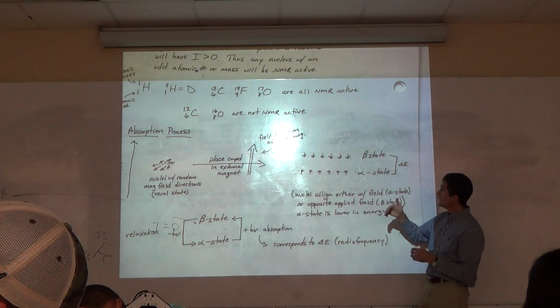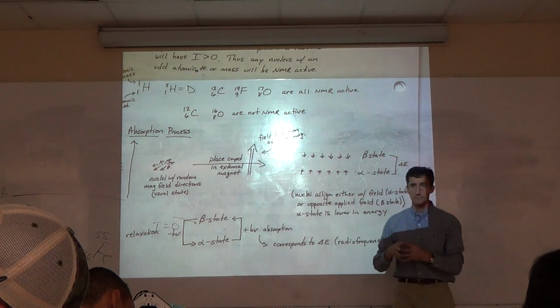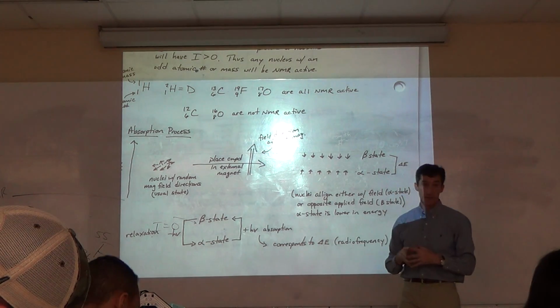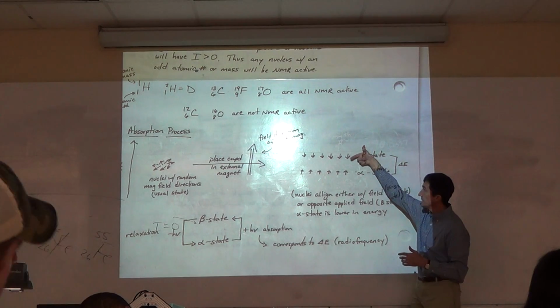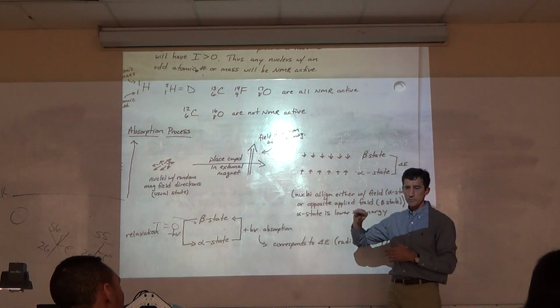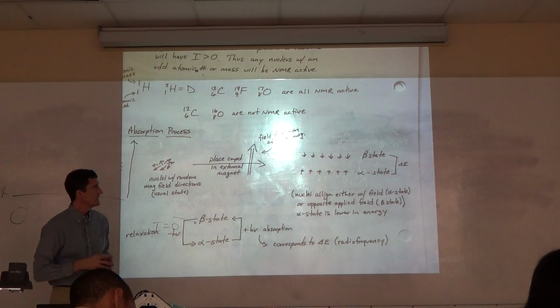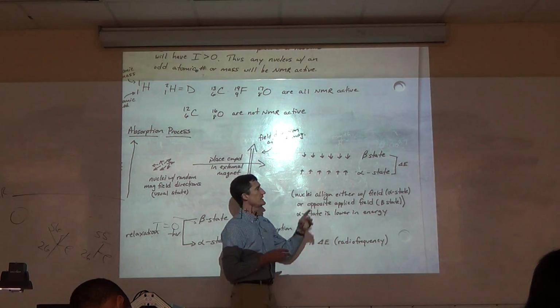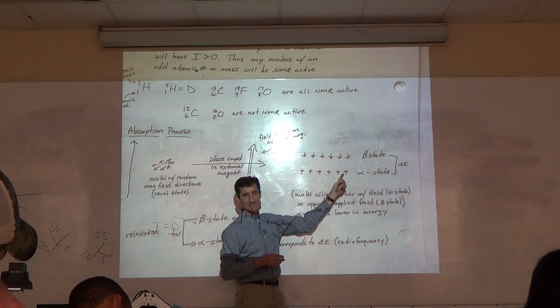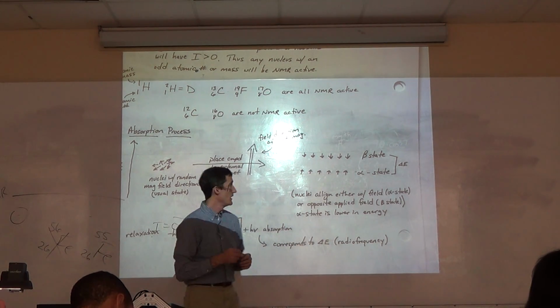But you'll also have some of those nuclei line up against the external field. Will it always be half and half? Good question. It's very close to half and half. You might think that this is not desirable. But this is actually very close, and the distribution is based on a Boltzmann distribution. I think I've seen, like, for every million you have here, you've got 1,000,007 here. So there's only 7 more here for every million.